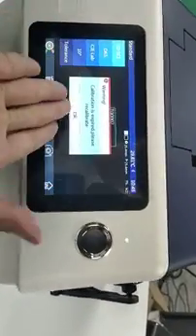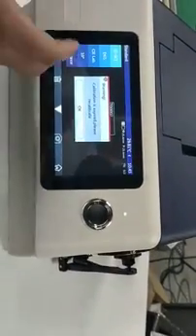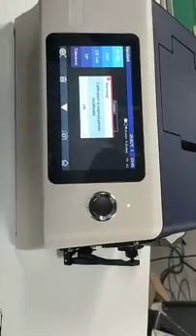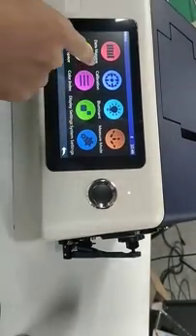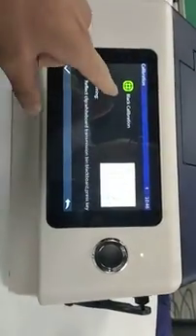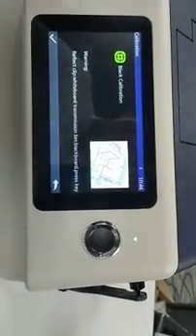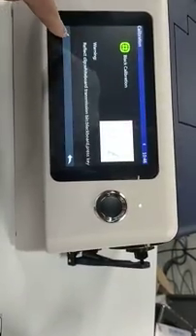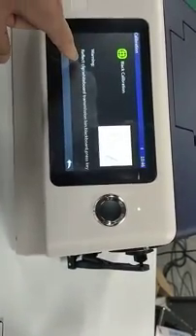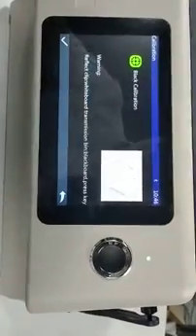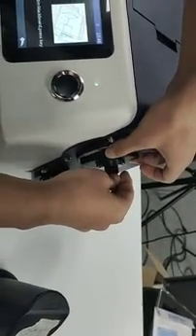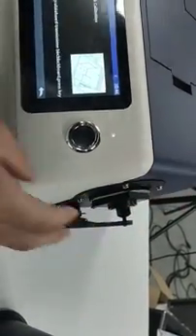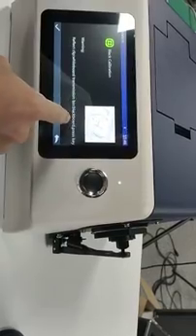For example, it needs recalibration. Calibration. Black calibration. First black calibration. Pay attention to its prompt. Reflect chip whiteboard. Yes. We put the whiteboard here. Transmission blackboard.